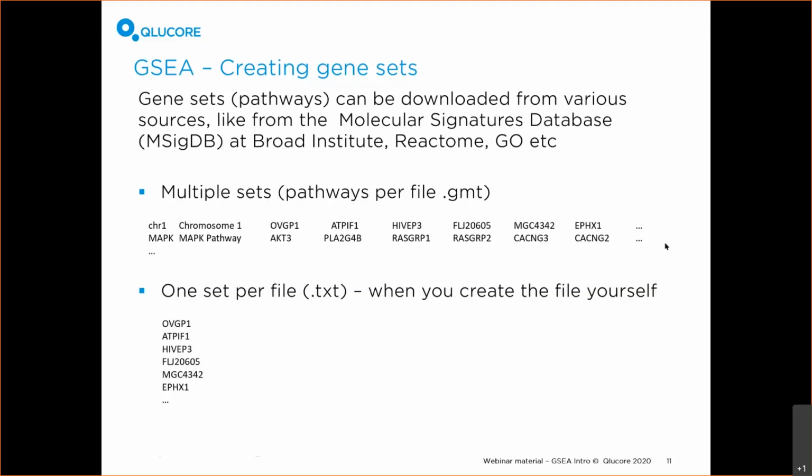You can also use TXT files when you have one set per file, and then it's a list going downwards. And these TXT files can be lists that you have generated from our software.